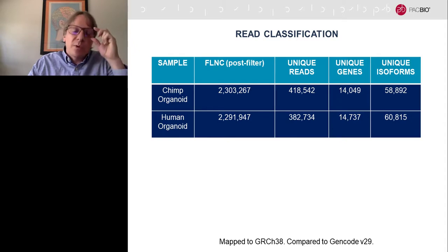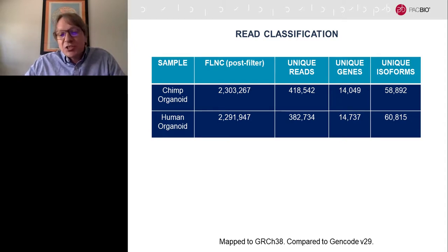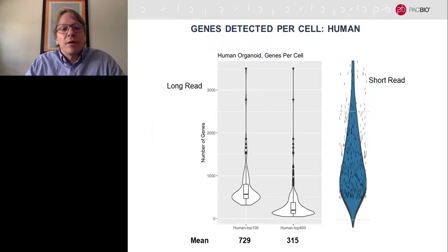And so what we got out of this is we could look at not just the number of genes you see in these samples, which was around 14,000, but we could actually look now at unique isoforms. We got about 4 times the number of isoforms from these cerebral organoids than you would have gotten from just counting the genes. So remember that the 3' end type of product that the Dolomite NADIA usually runs using the Drop-seq workflow involves a shearing step that would just record that 3' information. But now with the full-length information, we can actually record isoform level information.